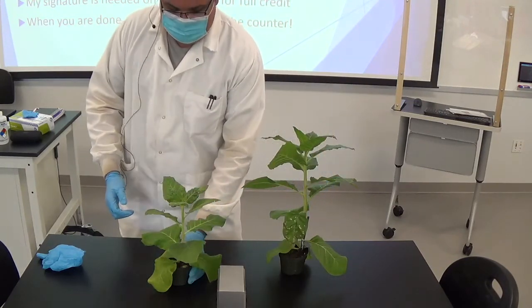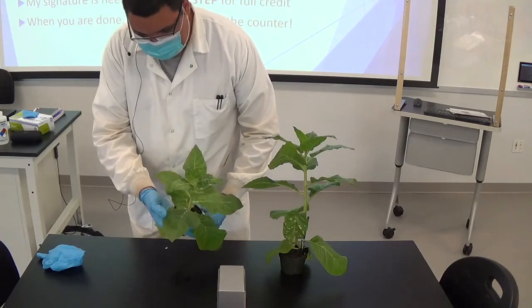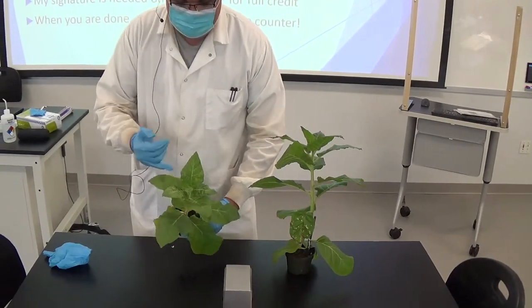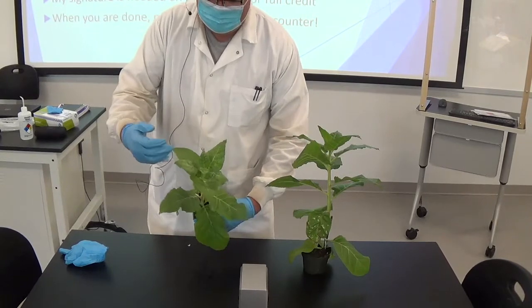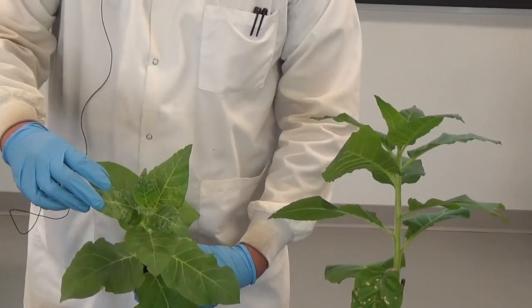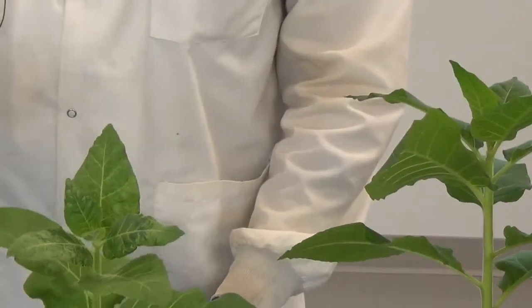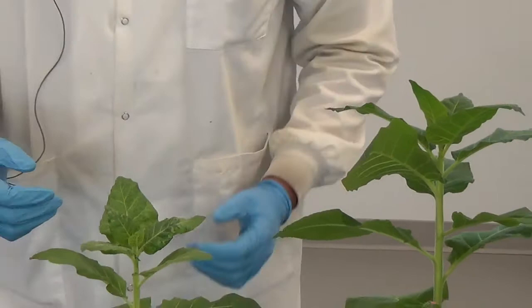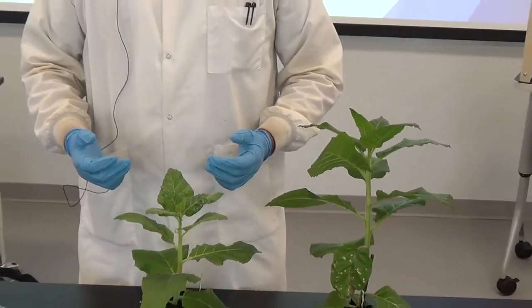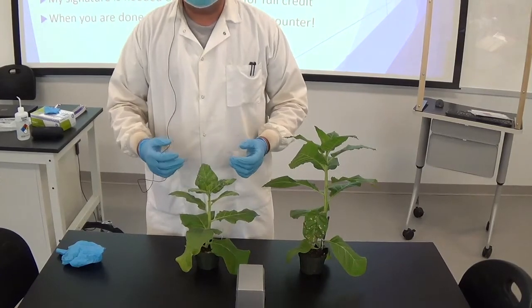Now, looking at the susceptible variety, you can see that the leaf that was inoculated doesn't look too bad over here. But if you look at the younger leaves, they all have these mosaic symptoms on them, which is characteristic of TMV. And the reason you see it mainly in the younger leaves is because the virus needs a lot of ribosomes and other things that are being produced in younger tissue in order for the virus to replicate itself.